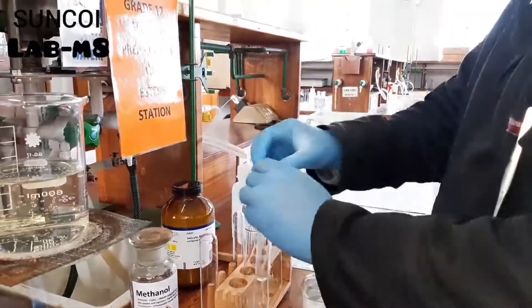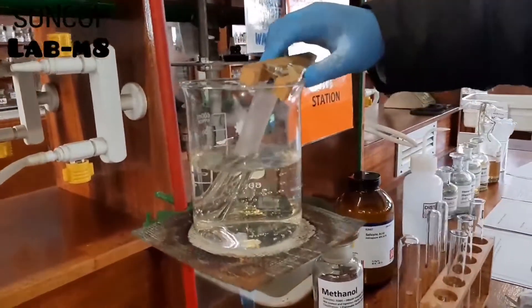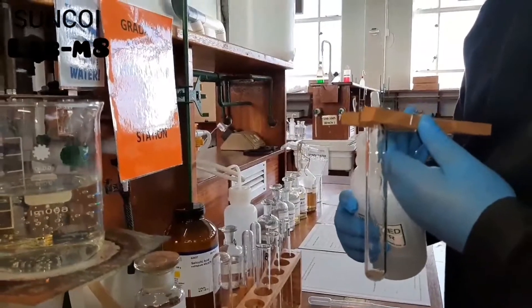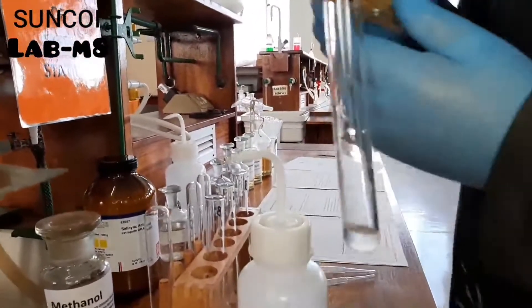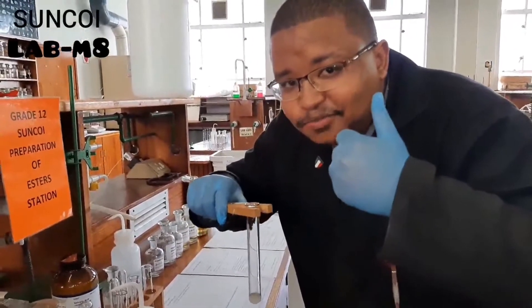He then places this into the water bath for approximately three minutes. After three minutes you take it out, add some distilled water, and then you can smell. A smells like wintergreen.